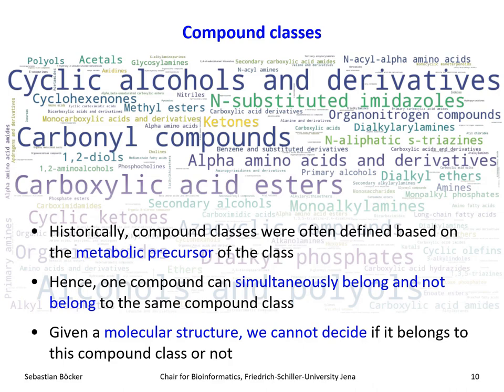If we see a structure, we cannot decide what compound classes this structure is. And what we want to do, that's our goal here, we want to have a query tandem mass spectrum, and we want to decide which classes this belongs to. So if we can't even do that for the structure, how can we do it if all we have is a tandem mass spectrum?